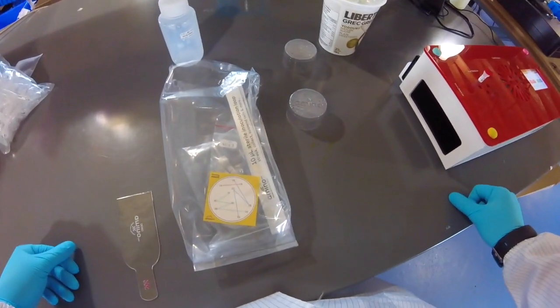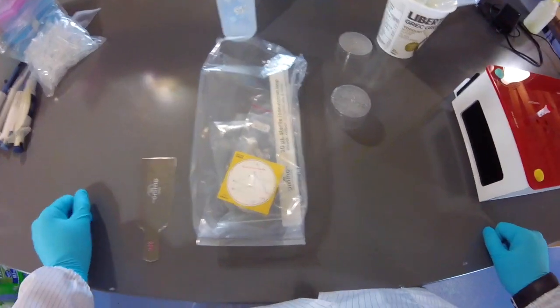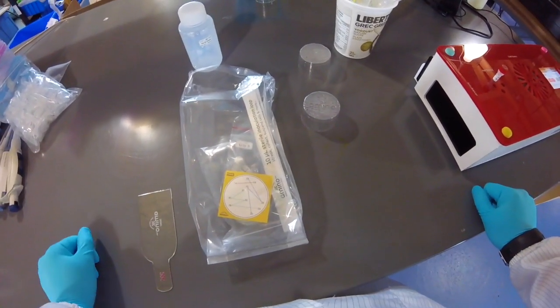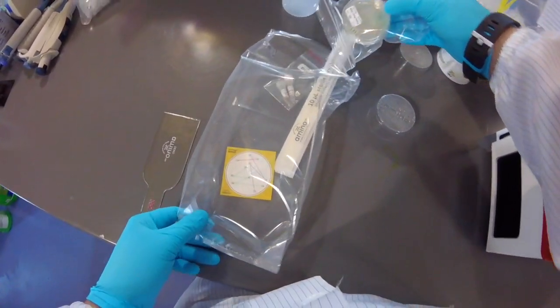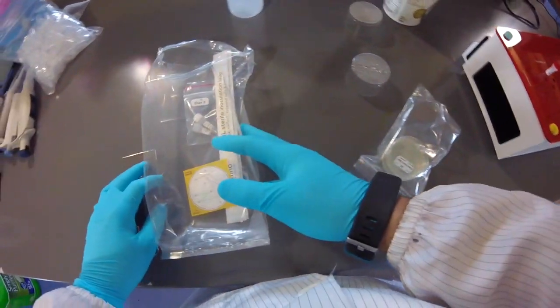Hello, it is day 3, and today we're going to take some of our recovered cells and put them onto the Petri dishes we made on day 1. So just as a quick recap, day 1 we made some Petri dishes. We made some selective and non-selective Petri dishes. The non-selective are the plates that don't have any antibiotics. The selective do have antibiotics.